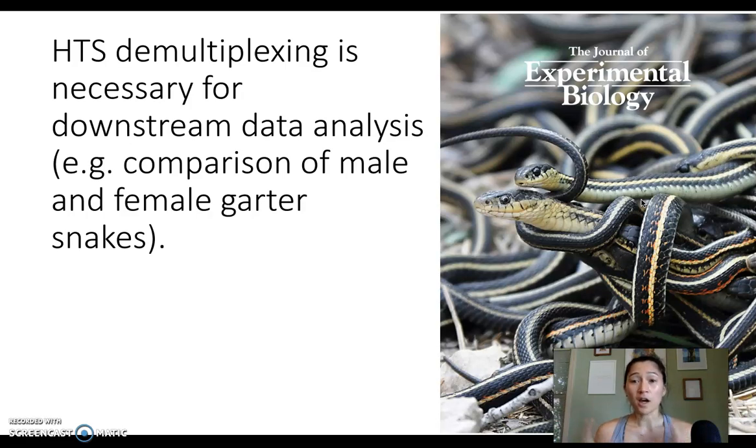For the high-throughput sequencing data that we're working with, which is from their study, we have to be able to separate out which reads came from the different samples—the male and female snakes—because that's the main question we want to answer. This demultiplexing step is essential to be able to answer our research question.